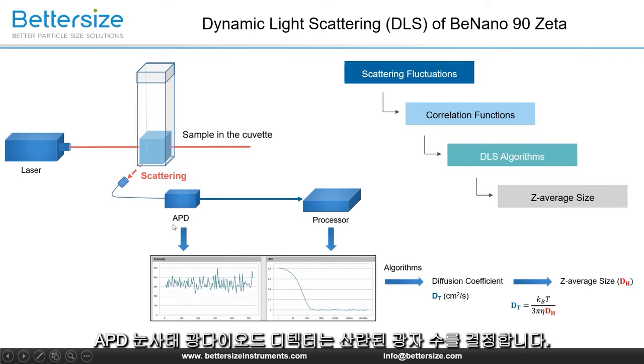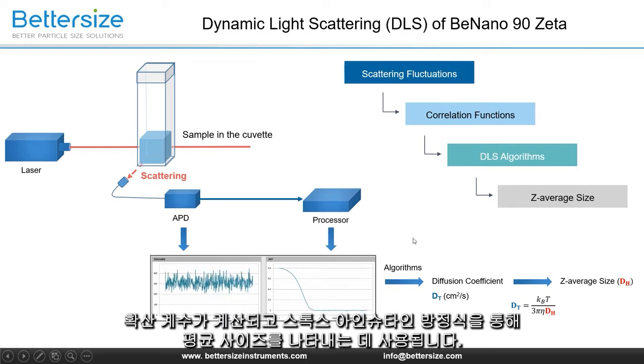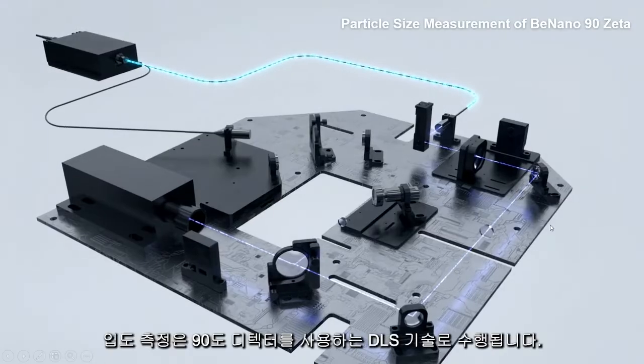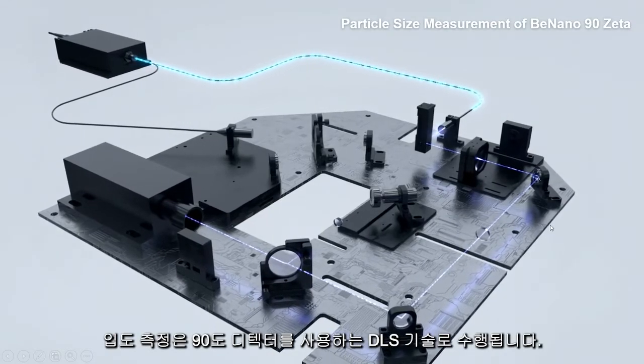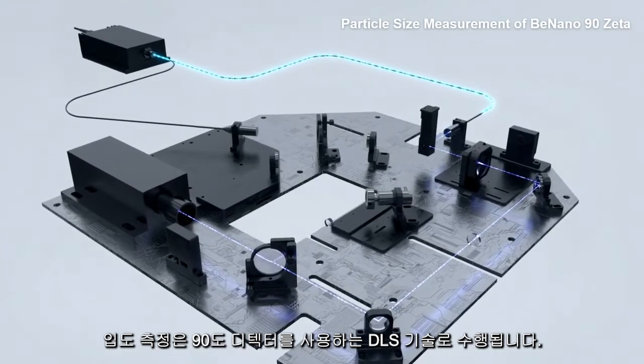The APD, avalanche photodiode detector, determines the number of photons in the scattered light, and the processor computes the sample autocorrelation function. The diffusion coefficient is then calculated and used to provide the average size through the Stokes-Einstein equation. Particle size measurement is performed with the DLS technology using a detector at 90 degrees.